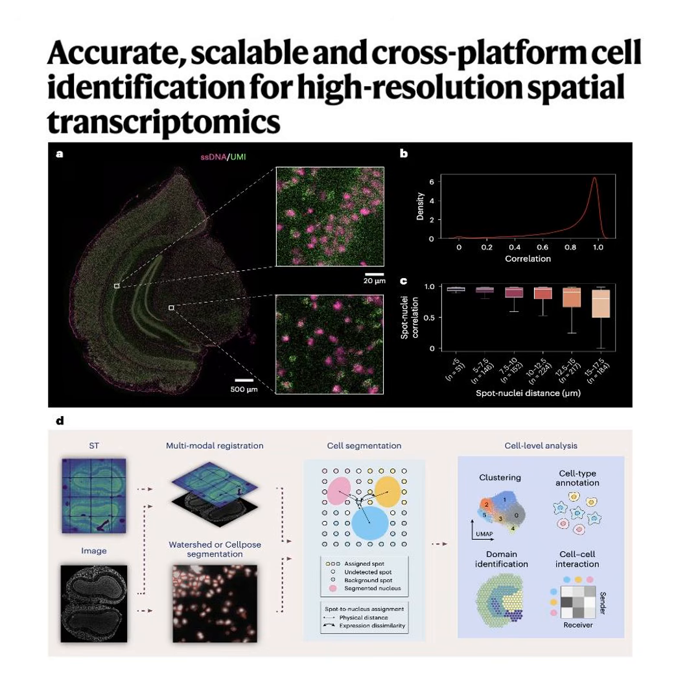Right. In the high-resolution world of spatial biology, that scattered pizza topping is human RNA. And figuring out exactly where it belongs is this million-dollar challenge known as the cell segmentation problem. It is, yeah. It's a huge issue. So welcome to today's deep dive. We are unpacking a May 2026 technical report from Nature Genetics. They're introducing this revolutionary computational method called Cellist, which is designed to solve this exact mess. I mean, it is arguably one of the most significant bottlenecks in single-cell spatial analysis right now.